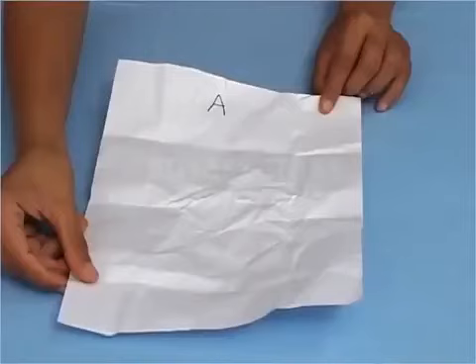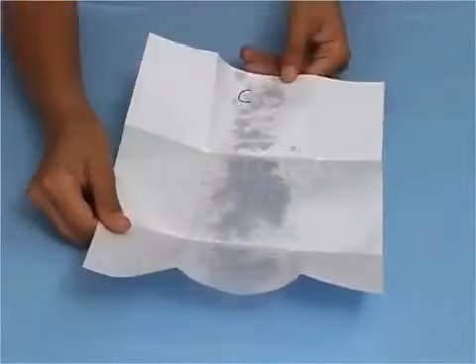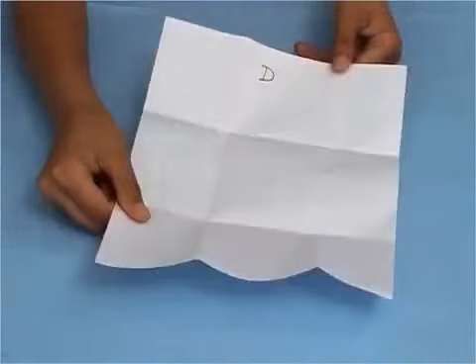What do you observe on the paper pieces? Let us see. There is nothing on the paper A and paper B. There are some peculiar patches on the paper C. No, there is nothing on paper D also.